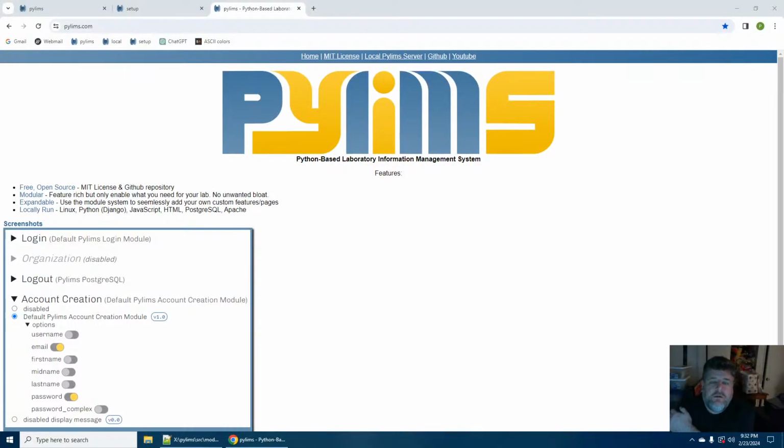Alright, I am just going to go over some of the updates that I've done since I last did this little blog thing. I have no idea. Alright, so this is the main page, which has been slightly updated.